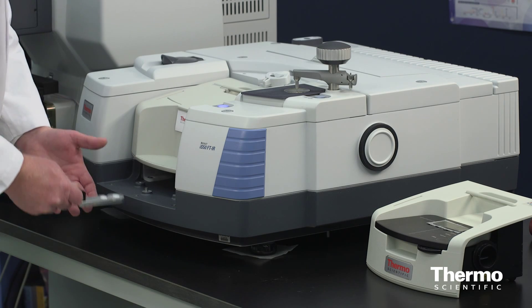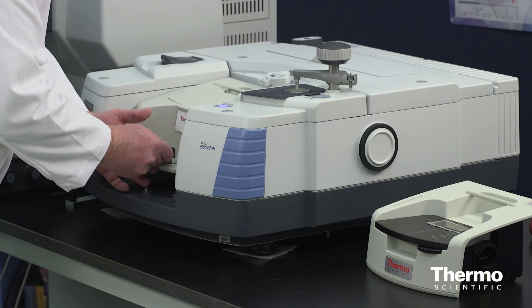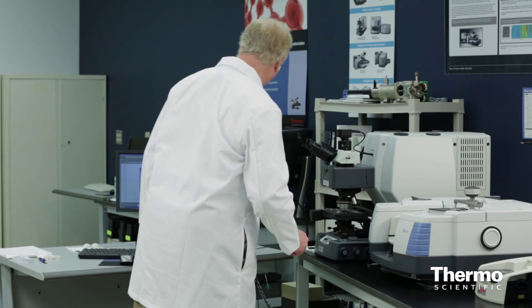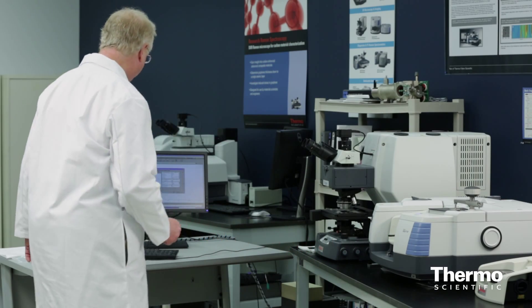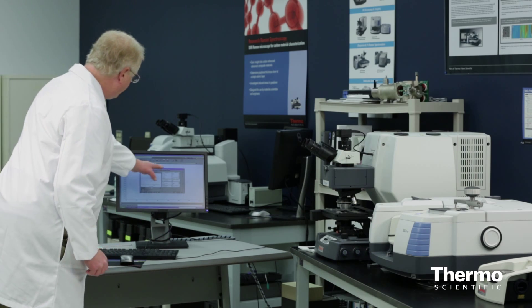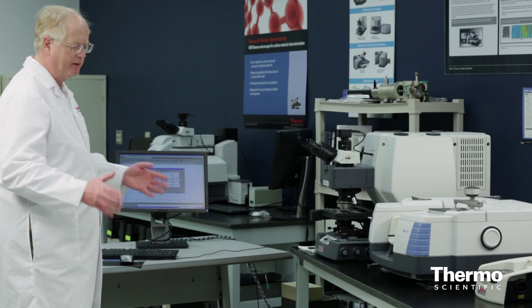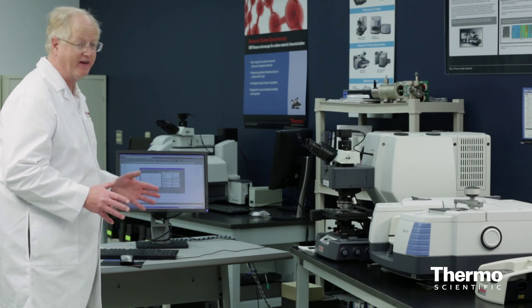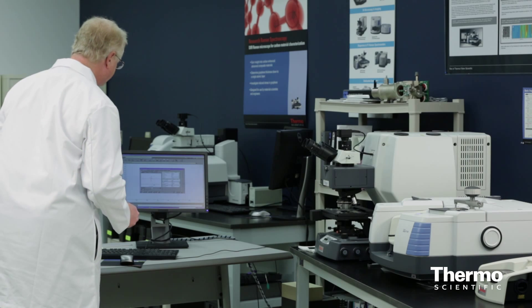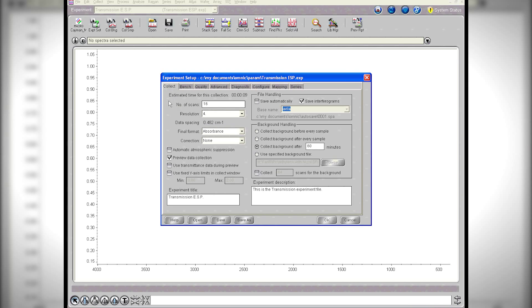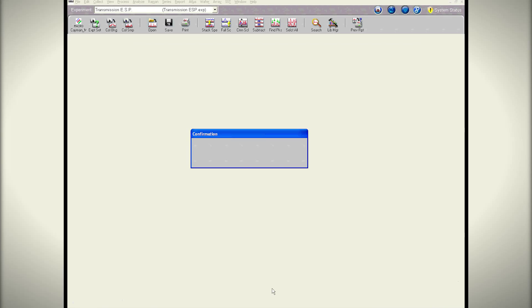What I'm going to do now is insert my sample via this shuttle until it reaches the first detent, and that's where I'm going to collect my background. Moving over to the computer, I've got it set up with the MCT detector — simply because for the sake of the demo it's faster, not because I need the MCT for this particular experiment. It's set up to collect 16 scans at four wavenumber resolution, so it will be a very quick experiment. Let's start by collecting our background.